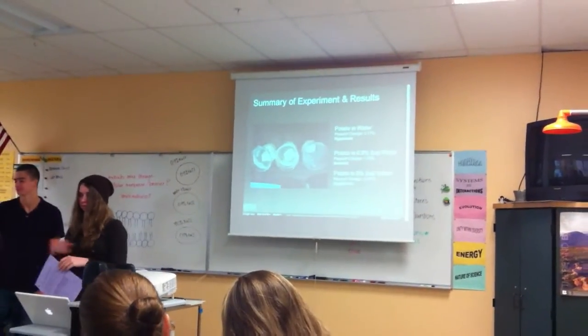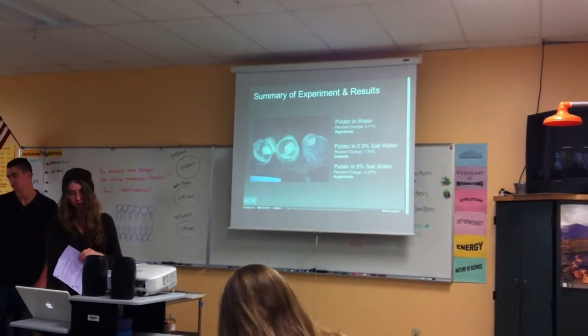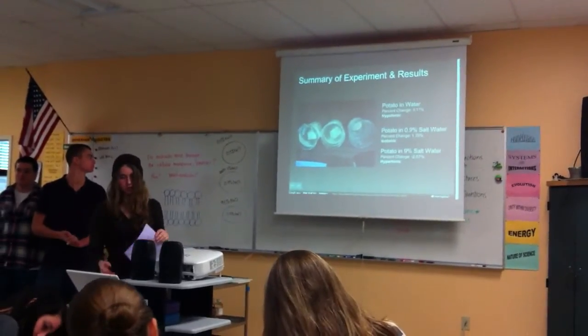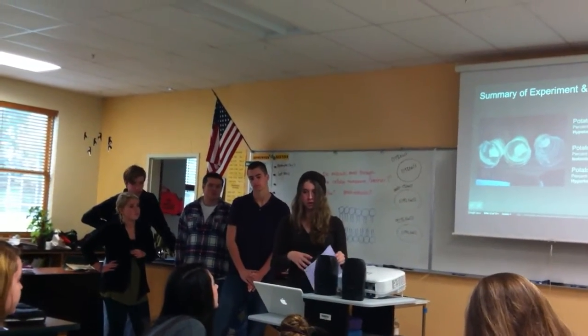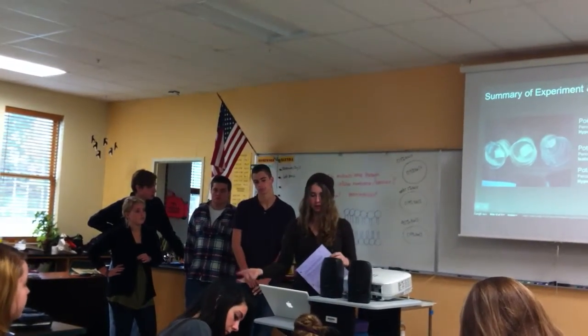What we did is we took cubes of potatoes and put them in solutions. So there was just water, there was 0.9% salt water, and then 9% salt water. And the potato that was just in water pulled in water because the concentration in the actual potato was less than what was outside of it.